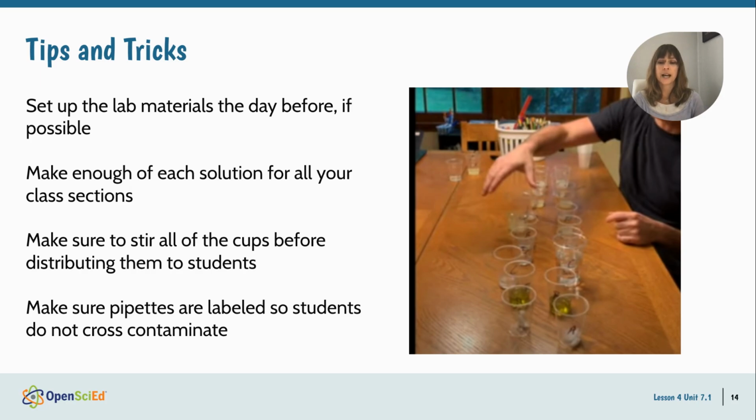It is totally worth the time for this investigation to set up. Try not to be overwhelmed by the lab setup. There is this great video again that shows you what the setup should look like. It's very helpful. Be sure to make enough solutions for each section of your class. Of course, the teacher edition will give you certain amounts that you may need to adjust to work with your needs. If possible, it's also helpful to set this lab up the day before because it does take around 35 minutes. You'll also need to label each pipette with the letter that corresponds to the substance.